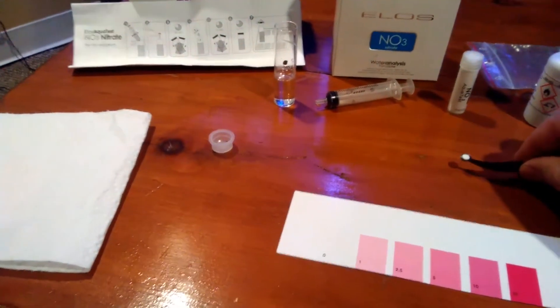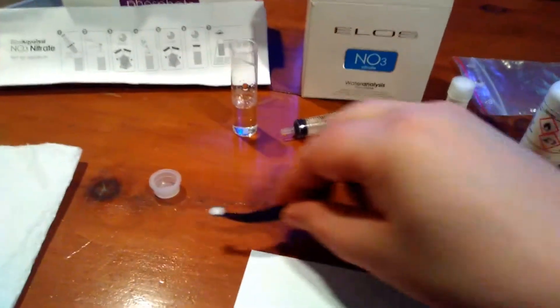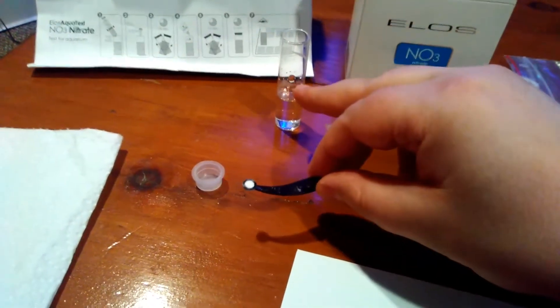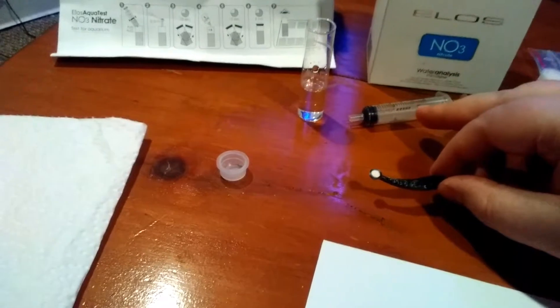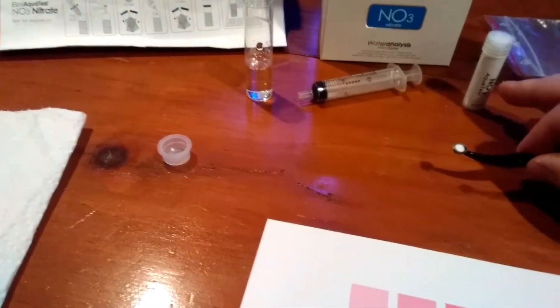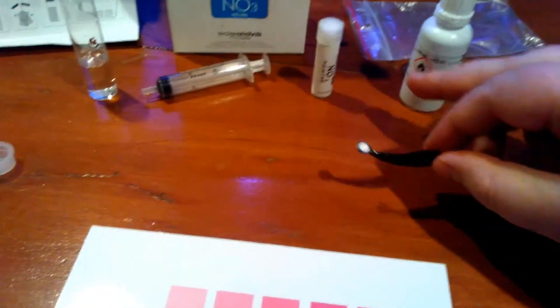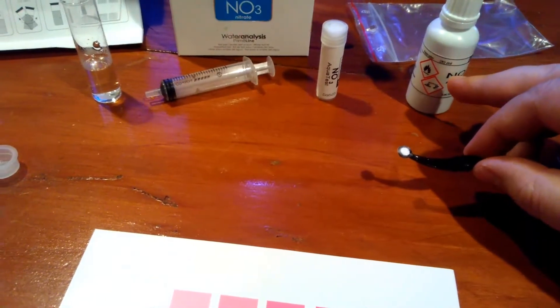Here are basically the things you need to know. That's the lid for the test tube. The test tube is filled by the syringe. The syringe is filled with your tank water. Here's the powdery agent on the spoon. Here's what you mix with afterwards.